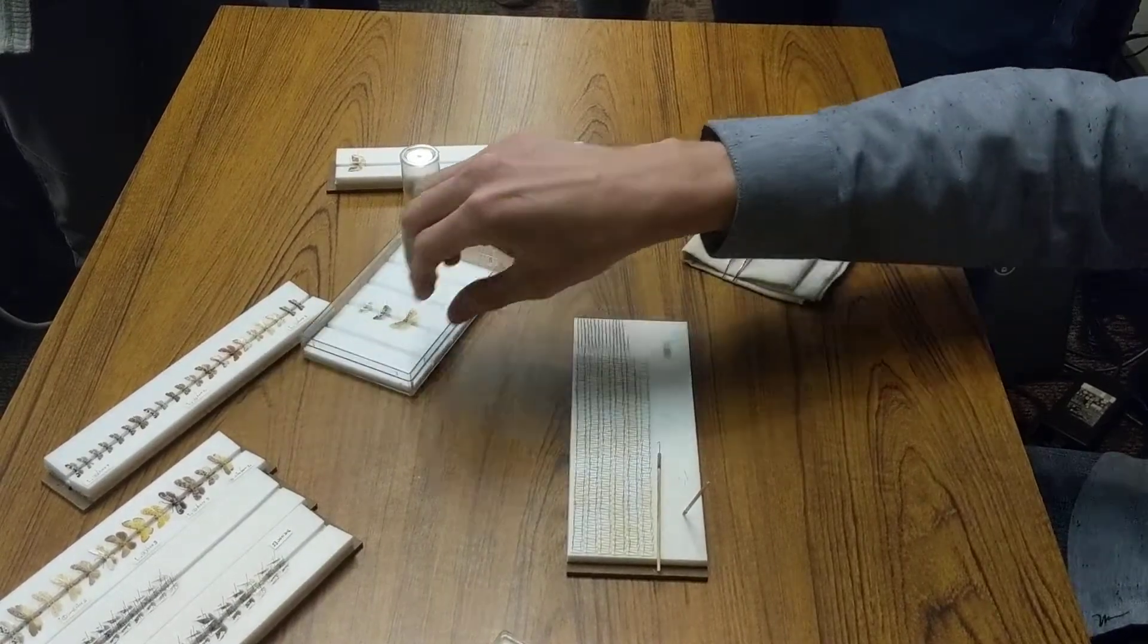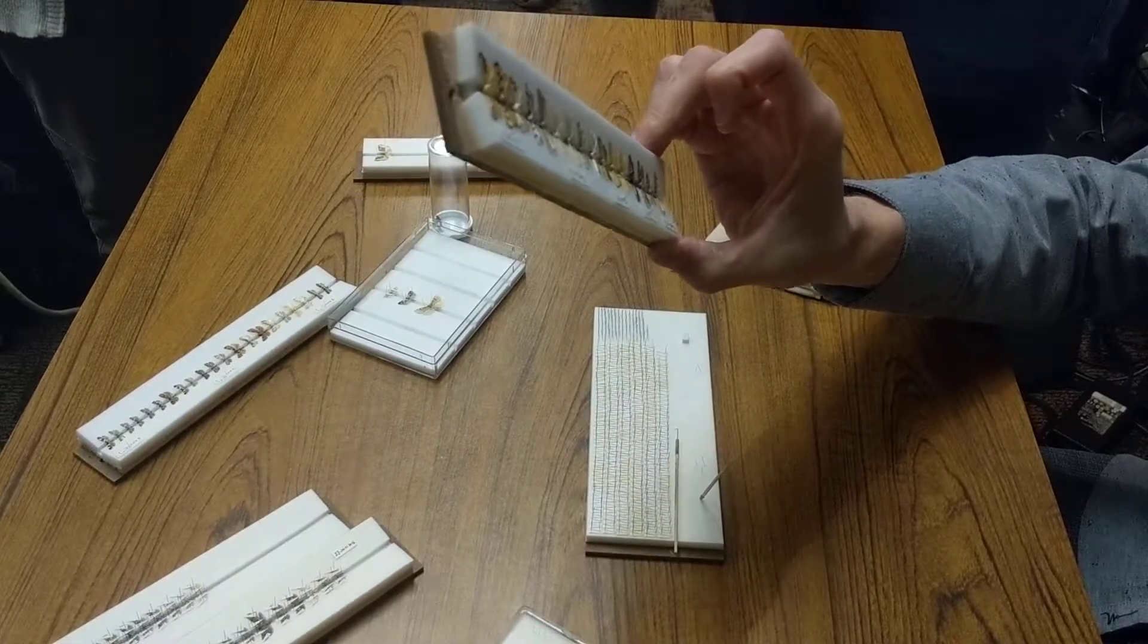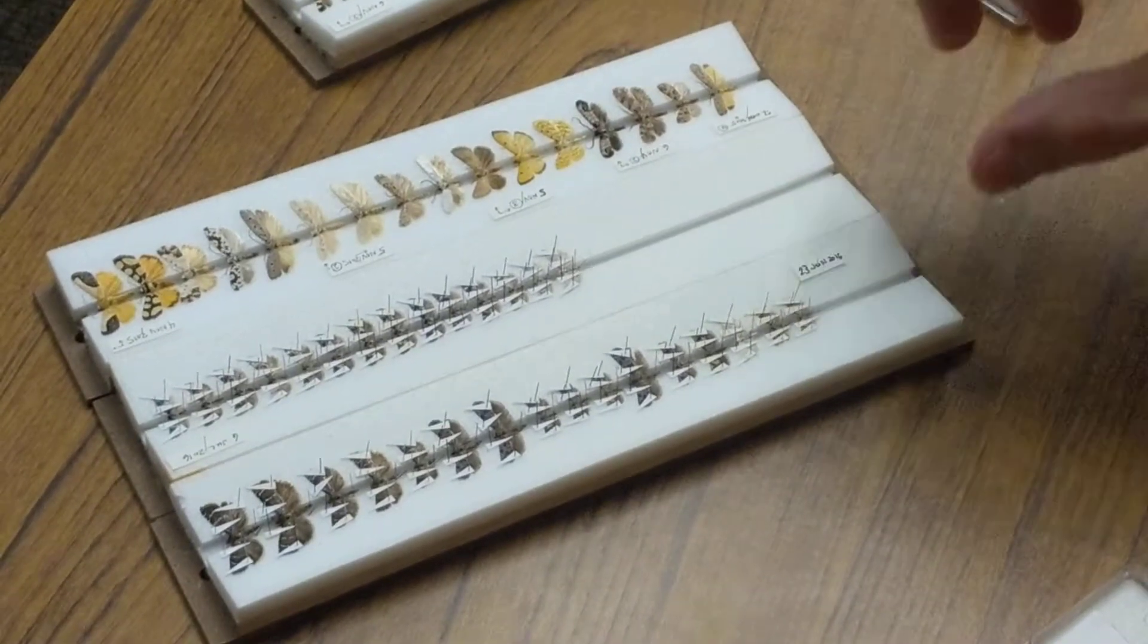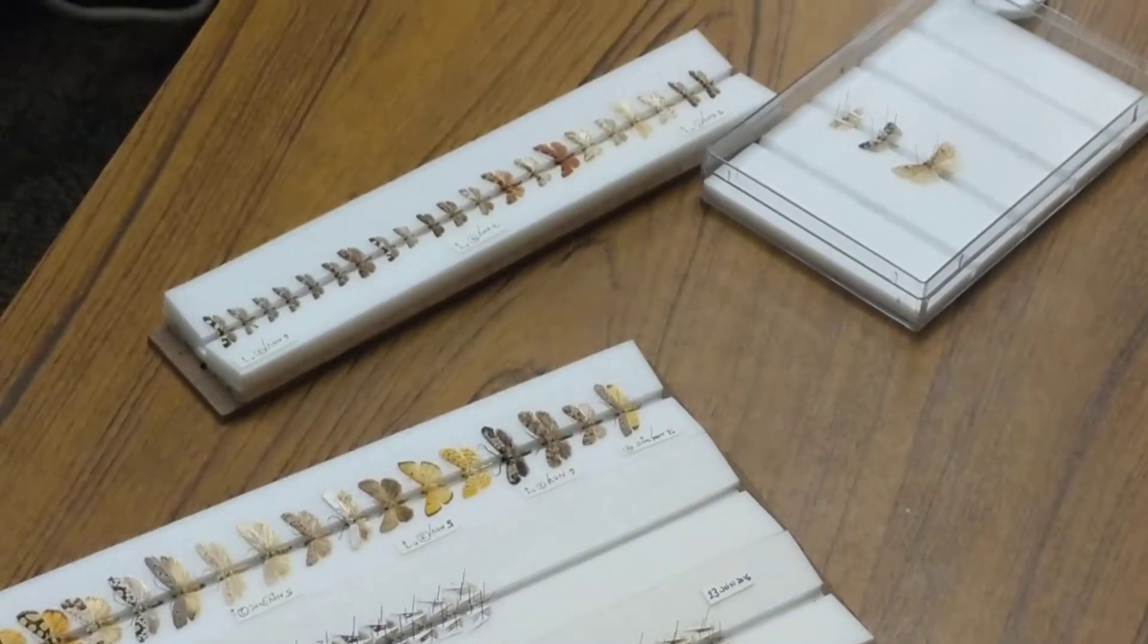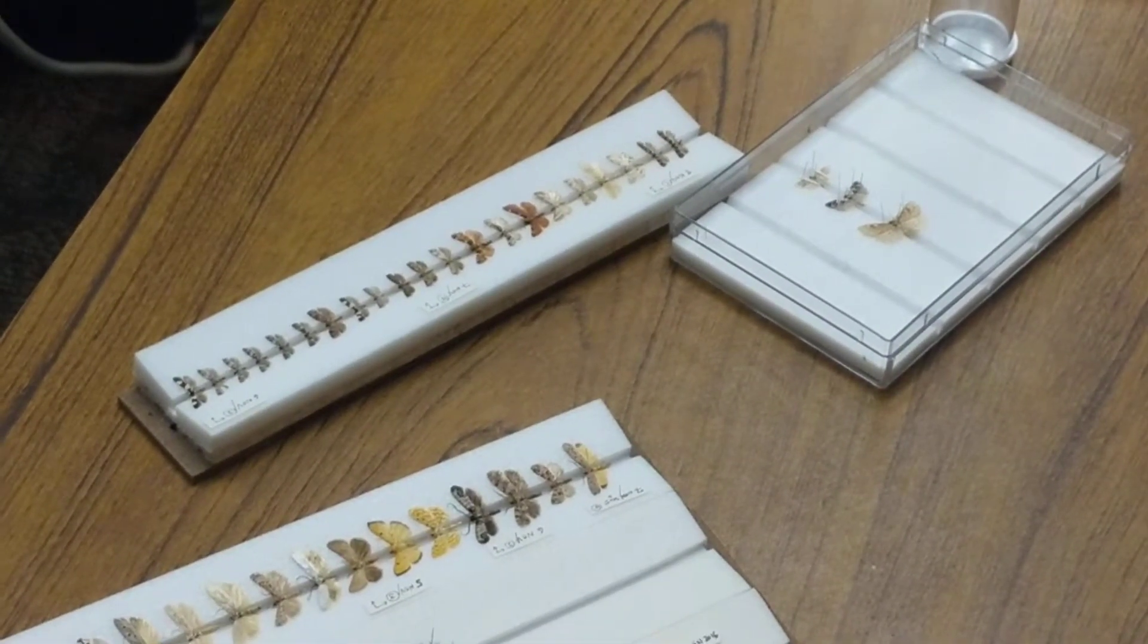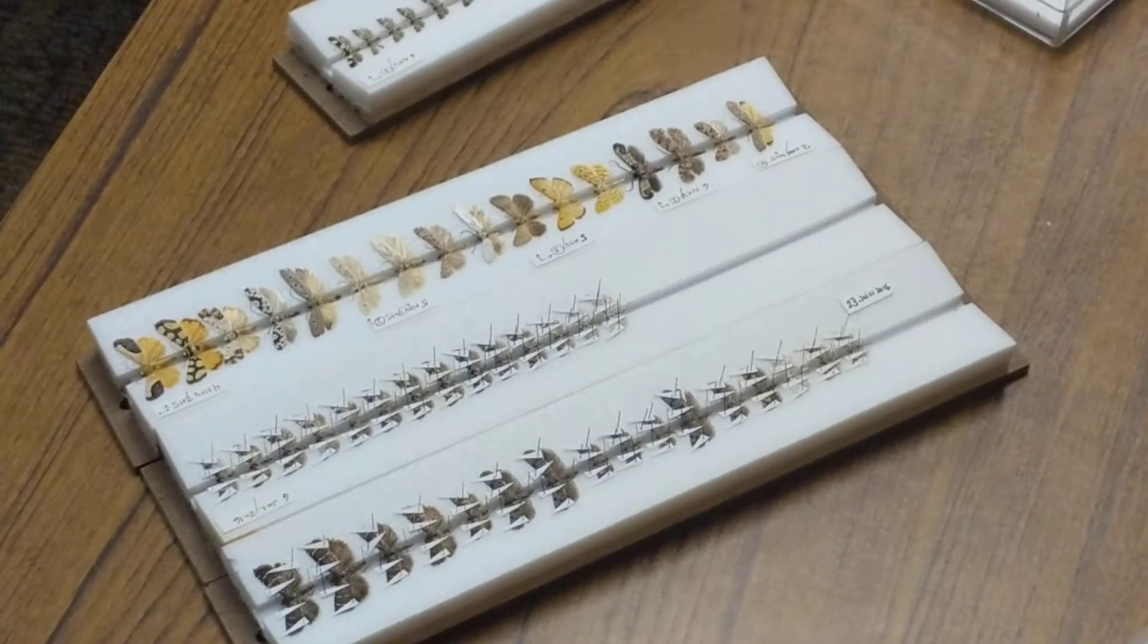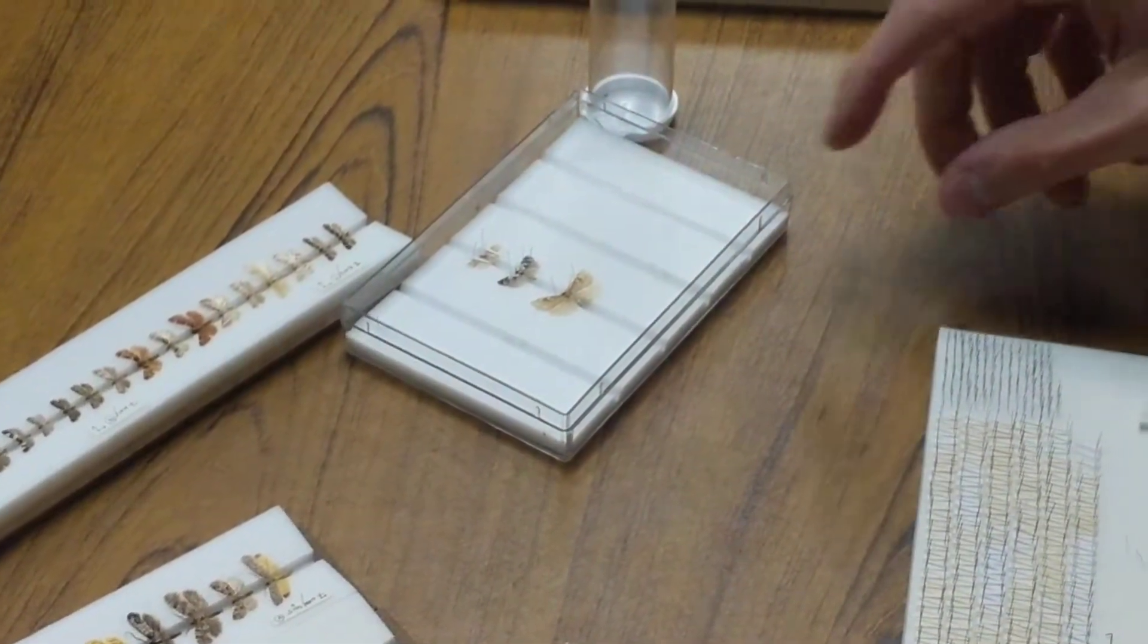These are from a couple years ago. Those look like South Africa. If you have the ability to do this in the field, I generally on these trips will spread eight to ten hours a day, every day. So get up at like seven in the morning, get the traps, sort the traps, spread until four in the afternoon, go put out the stuff for the next night, come back and spread some more, eat, brought to the sheet, collect off the sheet, and then do the whole thing again the next day. So it gets really tiring after a while. There's again a trade-off to having really fancy specimens versus this.